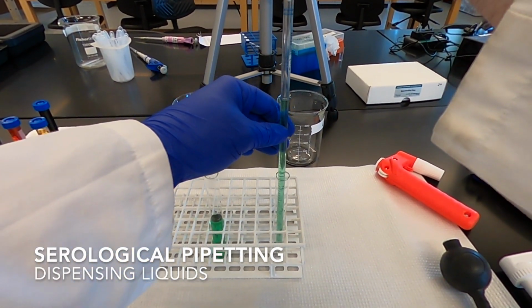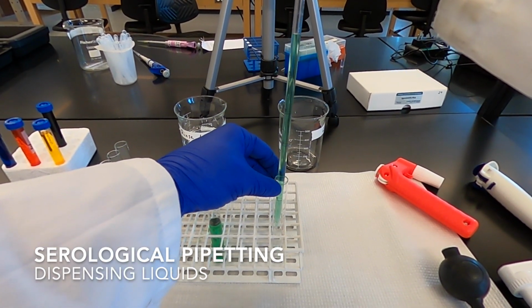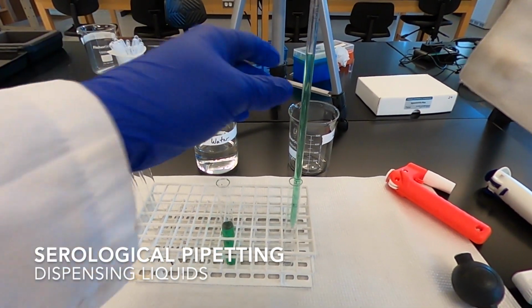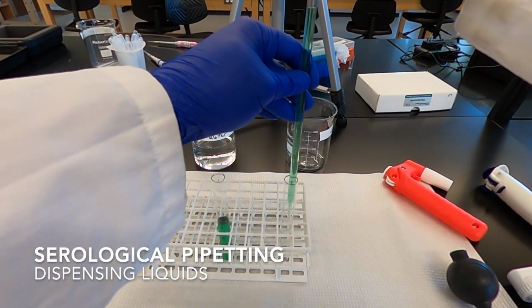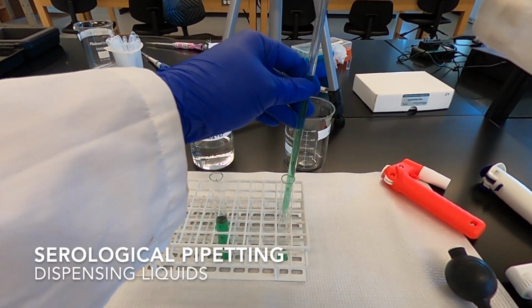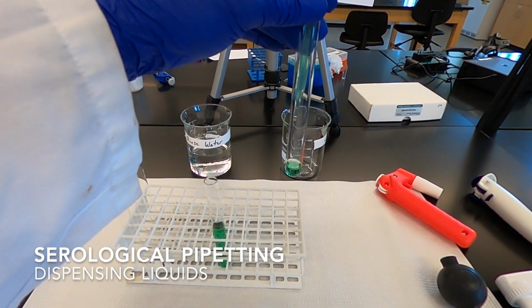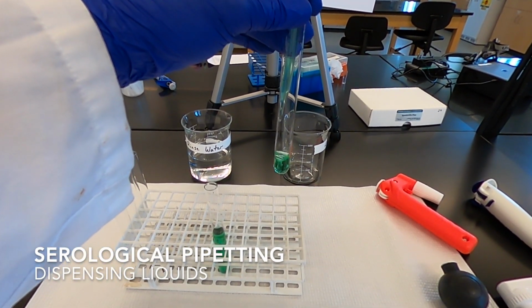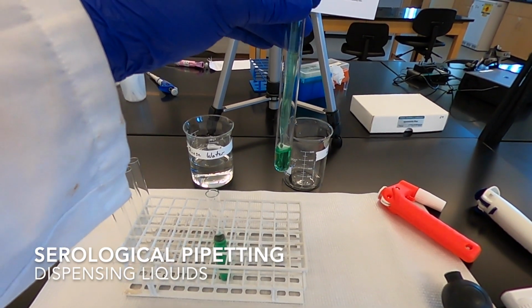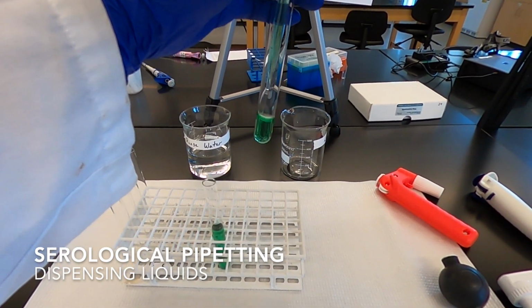Typically you want to put it on the bottom if it's a flask or a beaker. In the case of a test tube, I'm going to try to put it on the side. But the idea here is that you don't want to just splash your solution in there. So if I put this right in the middle and drop it, notice how it's splashing, it's making bubbles. If I put it on the side of the container, it'll drain neatly and cleanly in. Alternatively, you can put it right in the solution. You just need to be careful not to drown it.